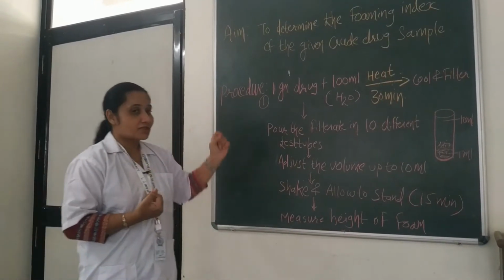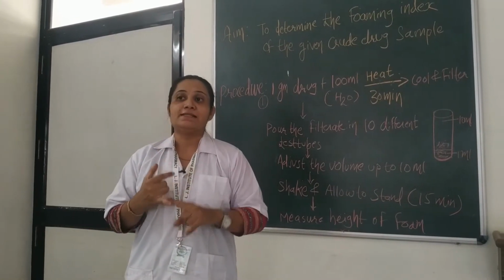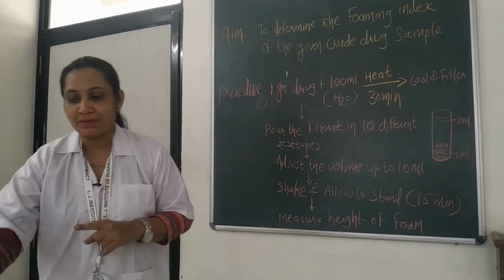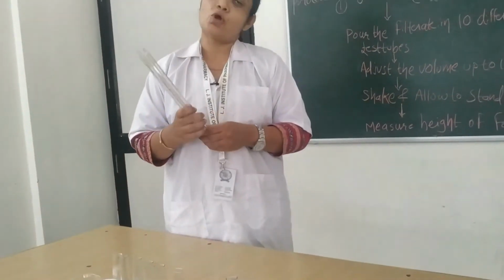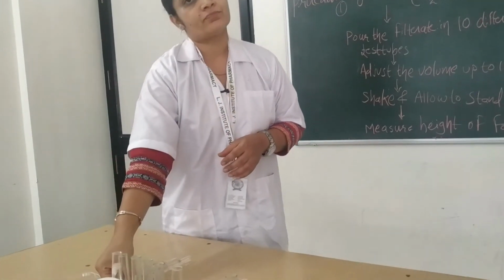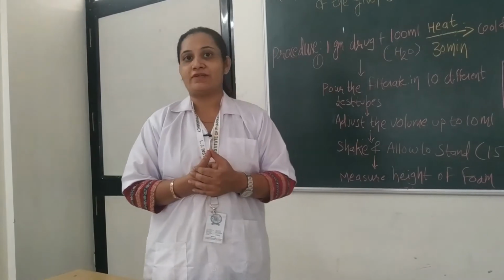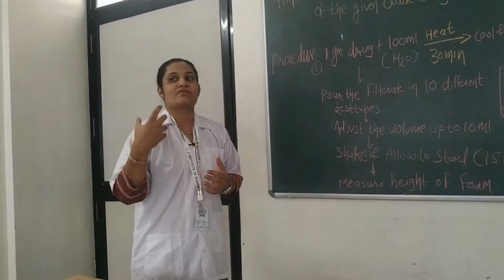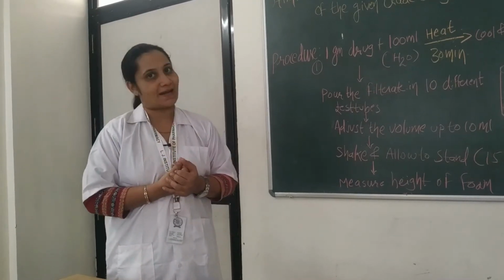Now, what are the requirements for this practical? We need beaker, test tubes, glass rod. We also need a heating mantle, funnel, tripod stand, Whatman filter paper. Before performing the practical, let us understand the procedure.